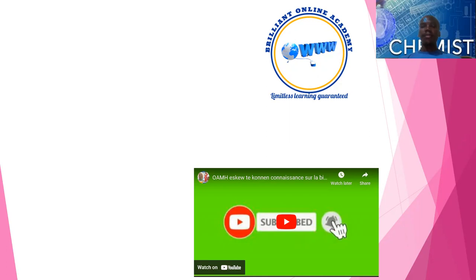Today I'm going to take you through chemistry form one, the first topic, introduction to chemistry, under the subtopic known as the Bunsen burner.